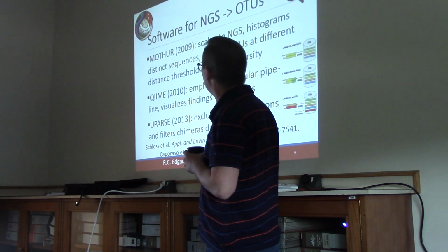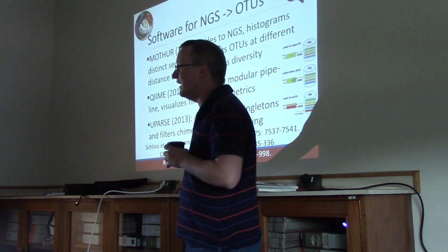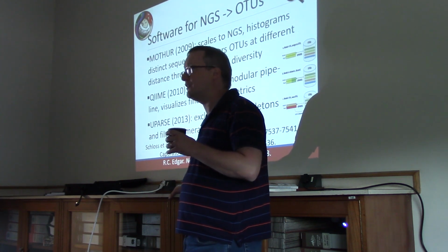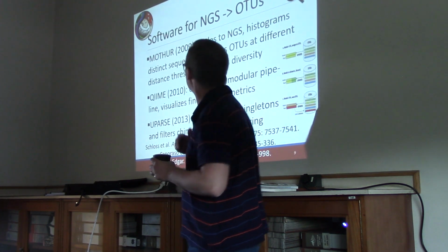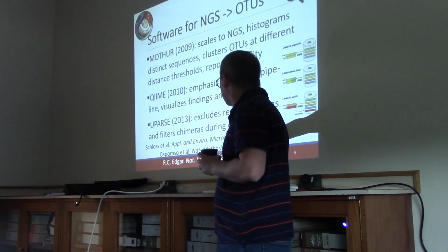So we start with MOTHUR. Now, if you look in the upper left corner, you see the logo for that. I have to say, the people at MOTHUR have a very good graphic designer working on their logo. I feel safe using this software. Isn't that pretty? That's really lovely. Okay, so this was published in 2009. I think it's the Schloss et al.